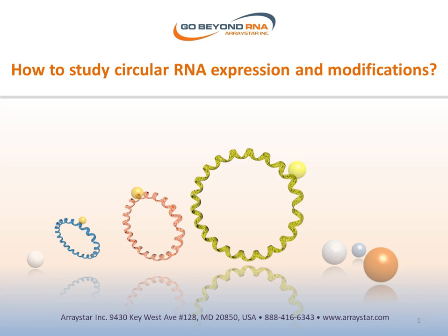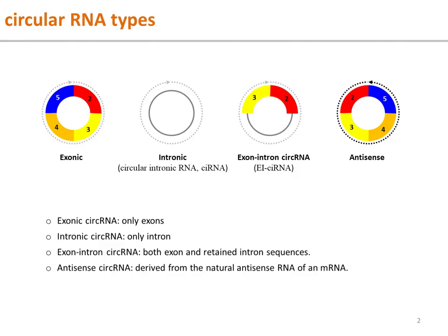In this webinar, we will talk about how to study circular RNA expression and epitranscriptomic modifications. Circular RNAs are covalently circularized single-stranded RNA loops forming an unusual RNA class.